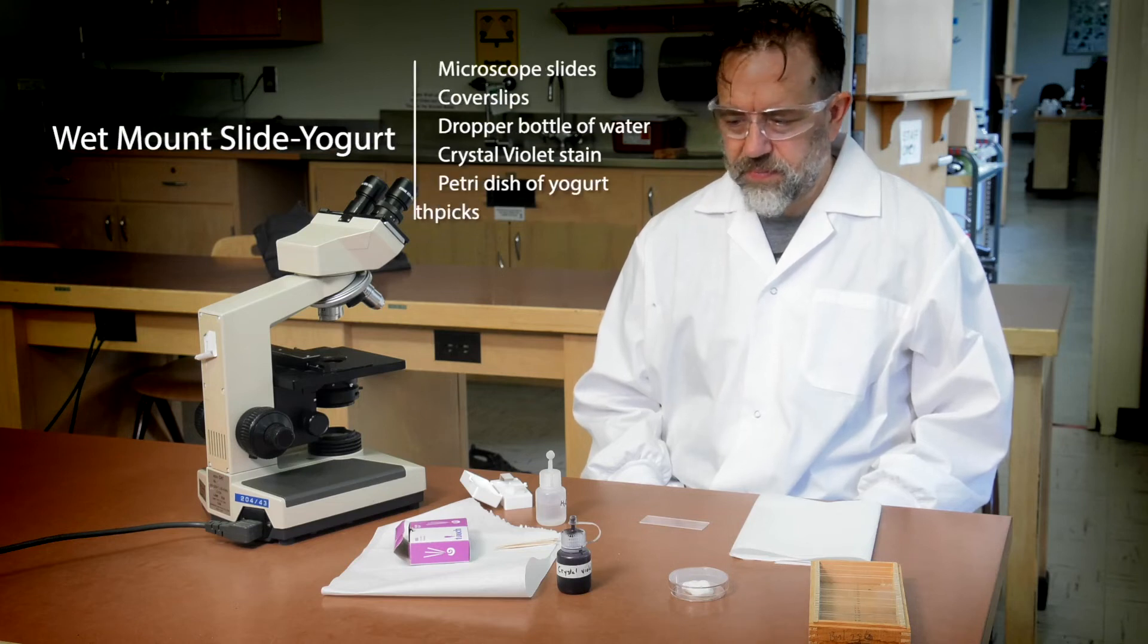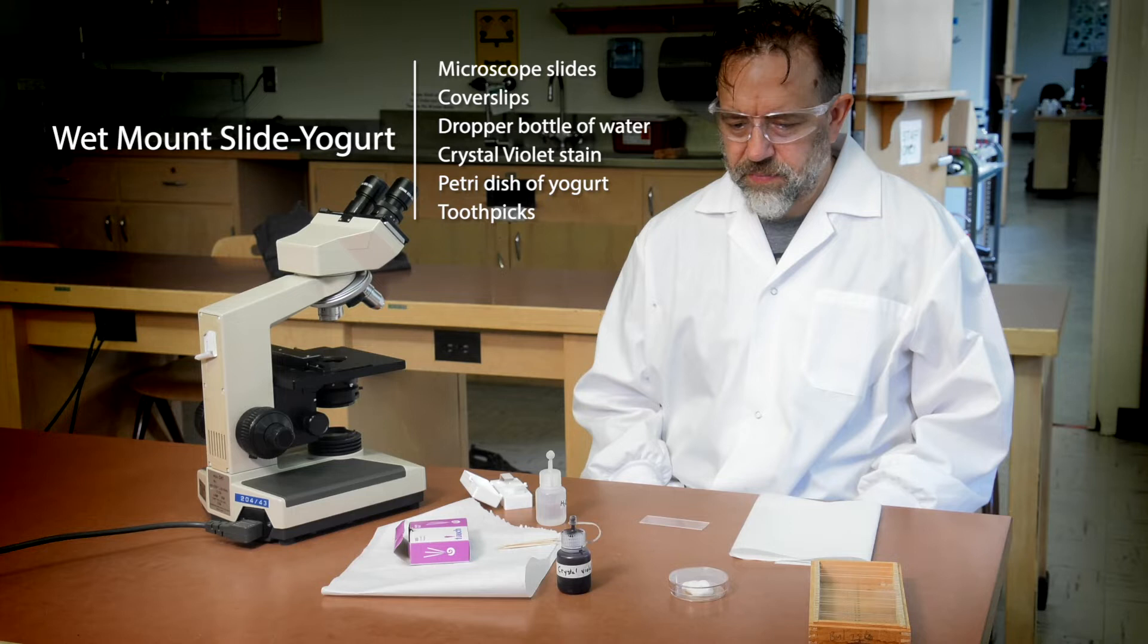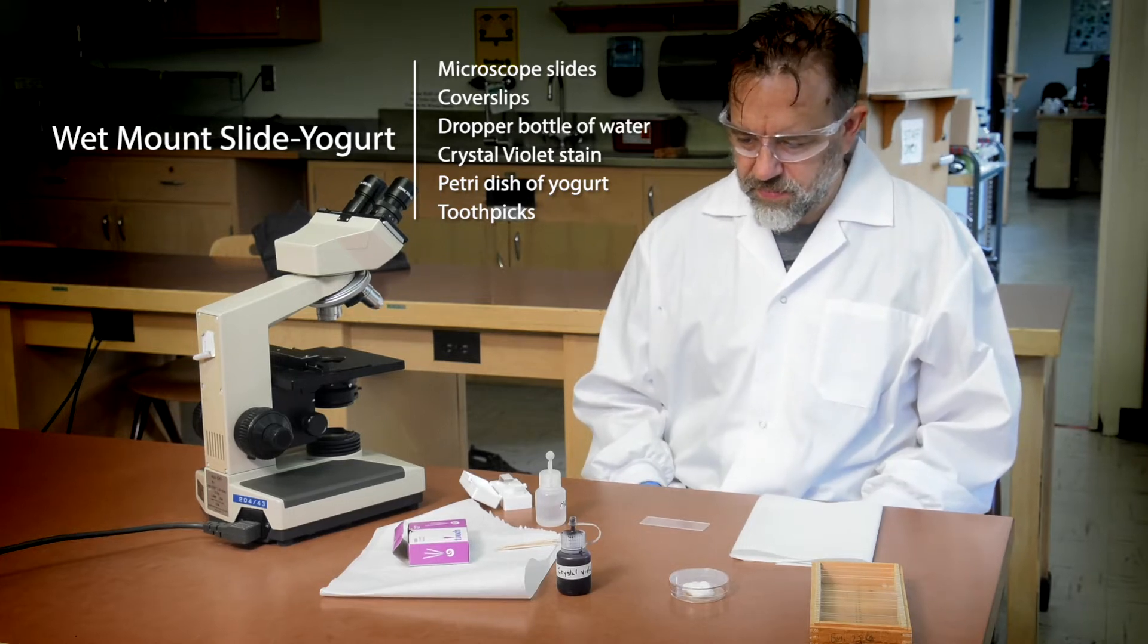Hello and welcome to the wet mount slide video tutorial. This video will go through the basics of making a stained wet mount slide of yogurt in which you should see yogurt bacteria.